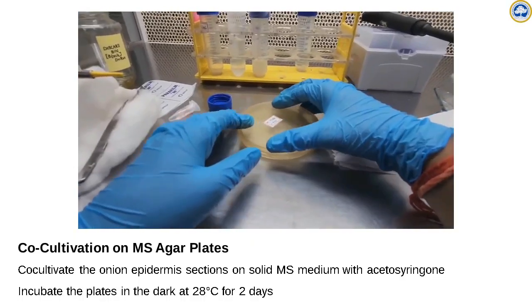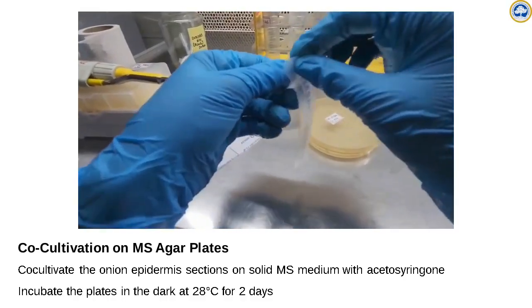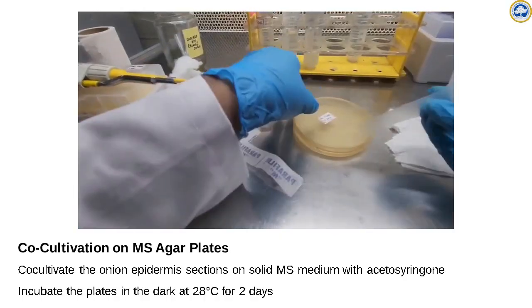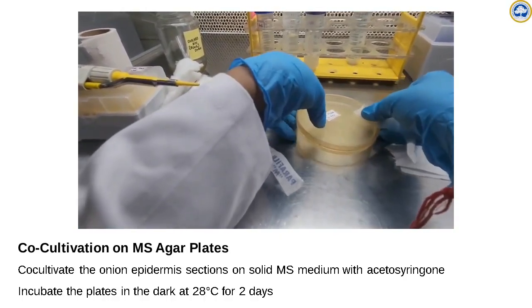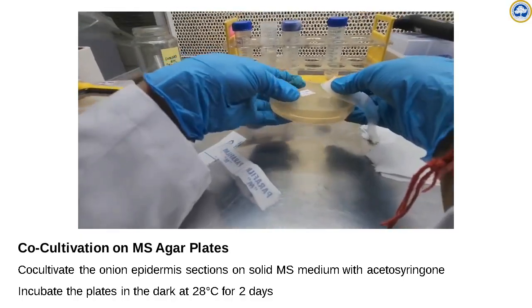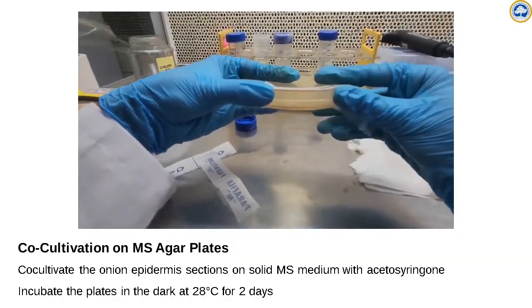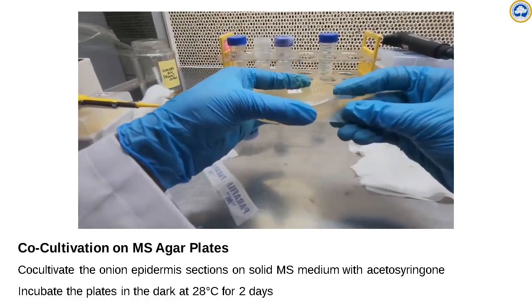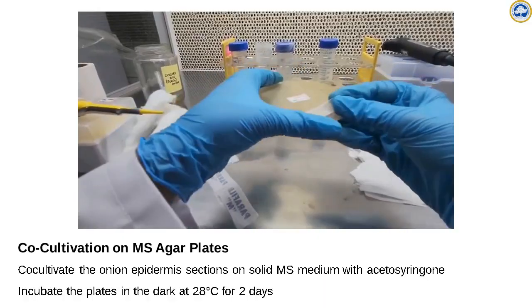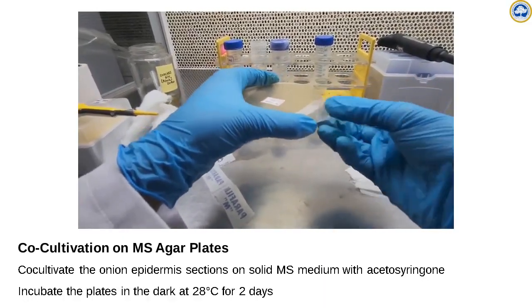So this co-cultivation is the time where agrobacterium infects the plant cell, transfers the T-DNA, and integrates it into the host chromosomal DNA. The co-cultivation time can be optimized based on the expression level that you see.